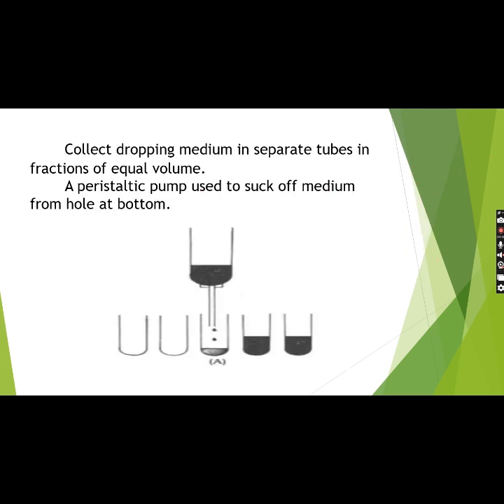The test tube is punctured with a needle at the bottom, where the higher density component is separated, while at the top is the low density component. Without disturbing the low density component, the high density component is separated off by puncturing and collected in the fraction test tubes. After that, another test tube can be used for low density component collection.